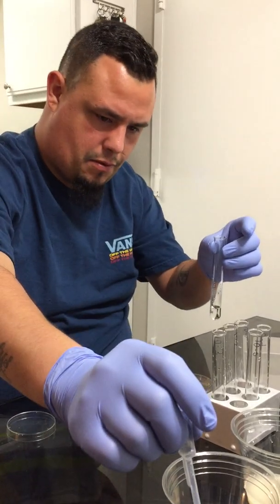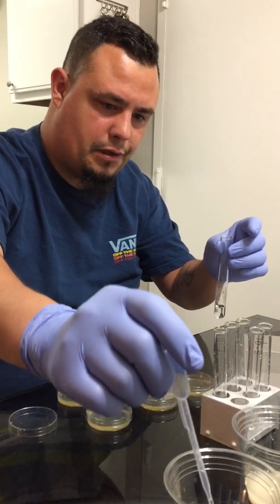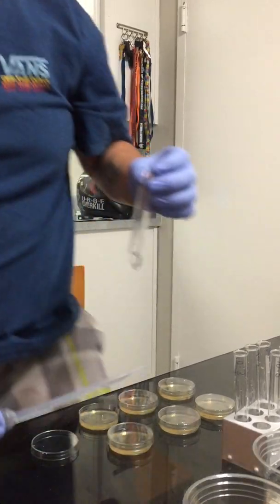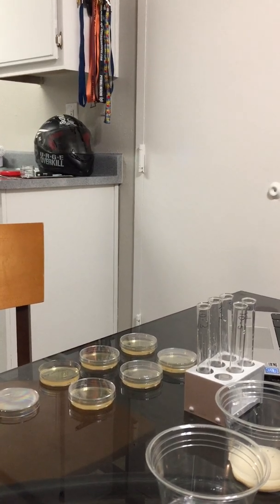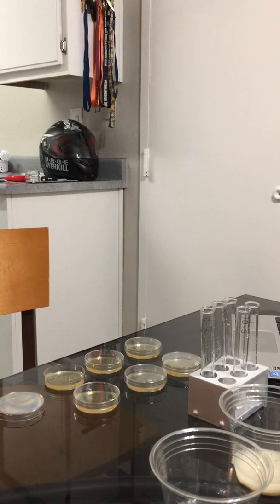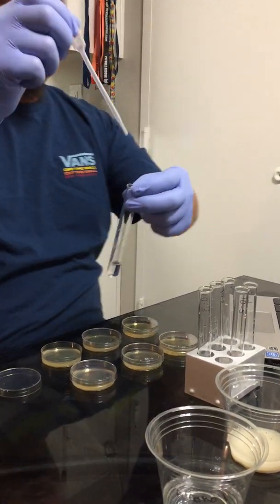The pipette isn't working here. It has a hole in it. No problem, I'm just going to grab my other pipette. That one's probably just been used a little too much.